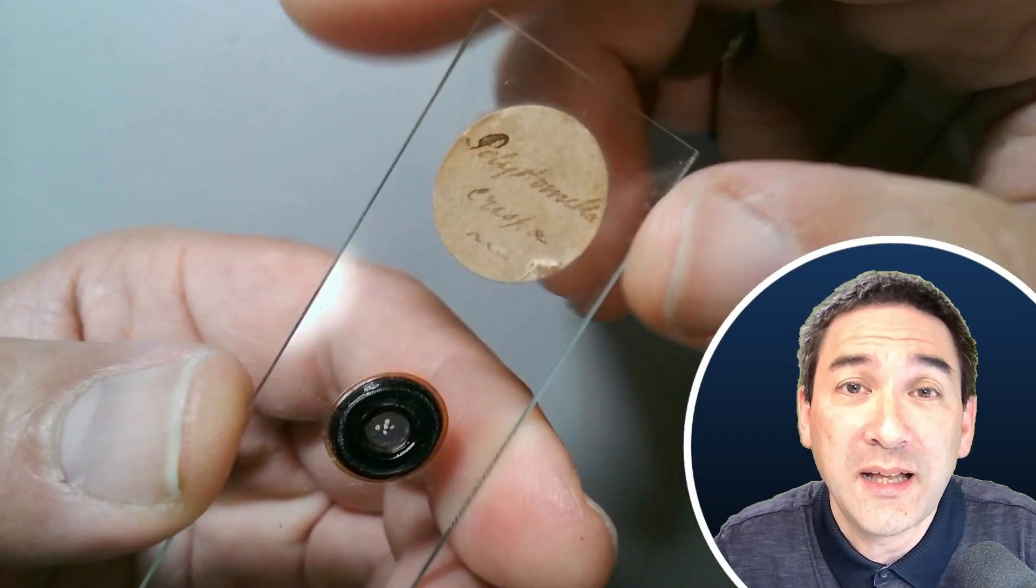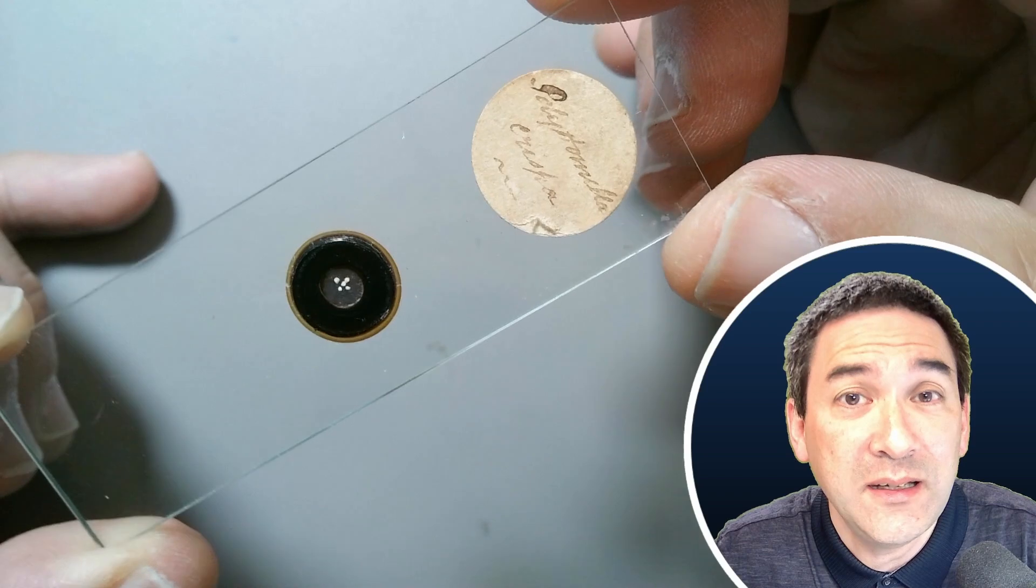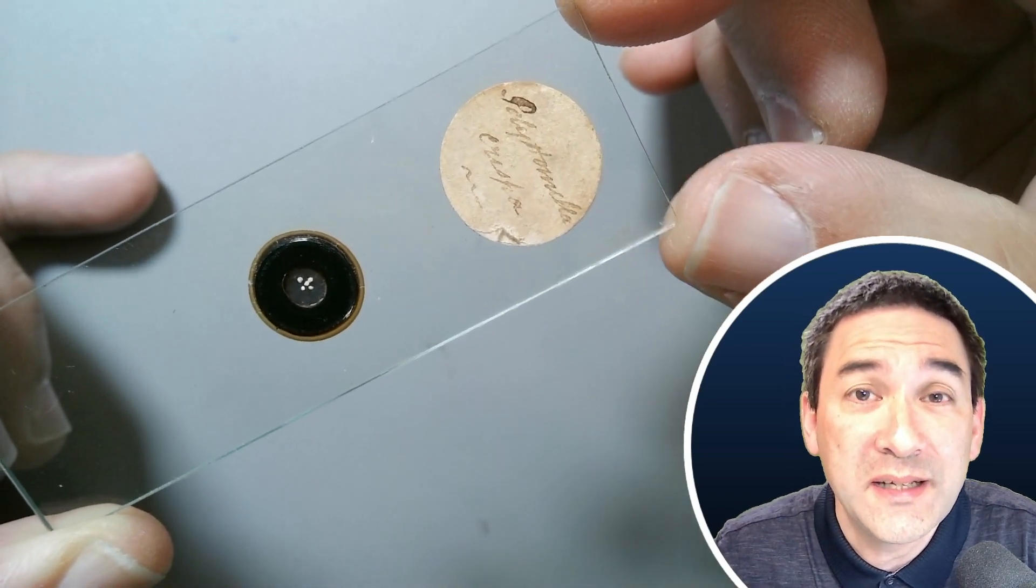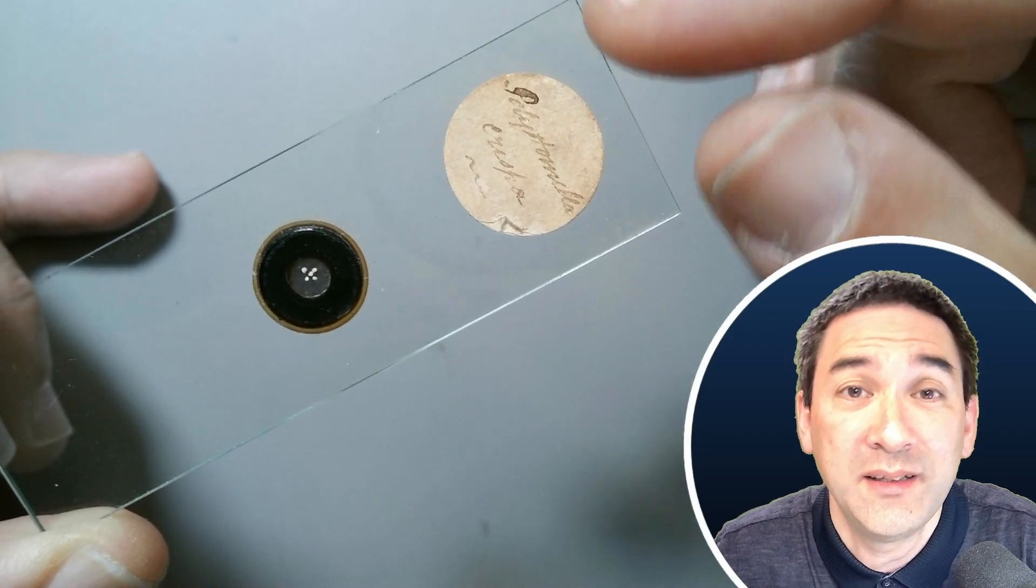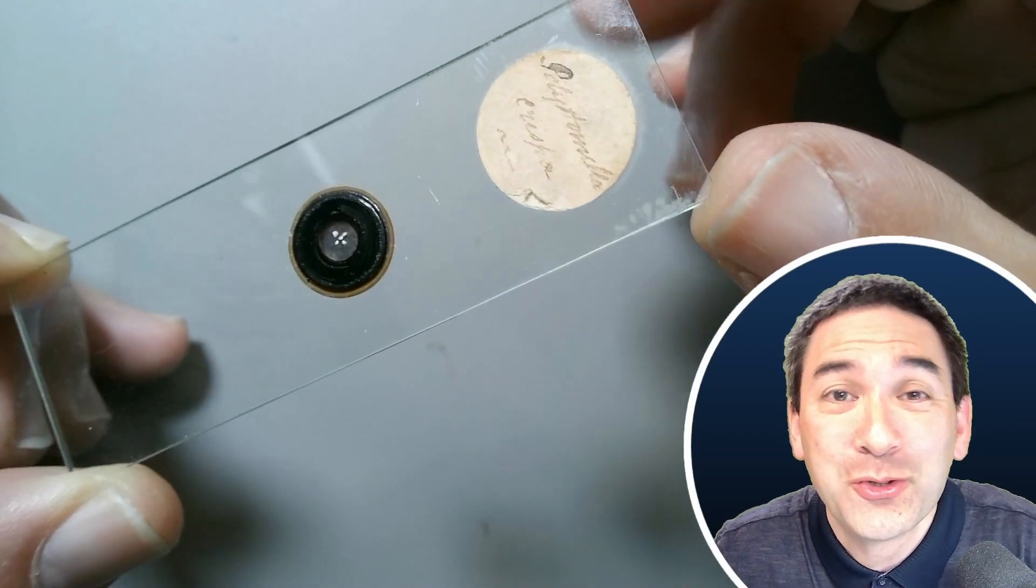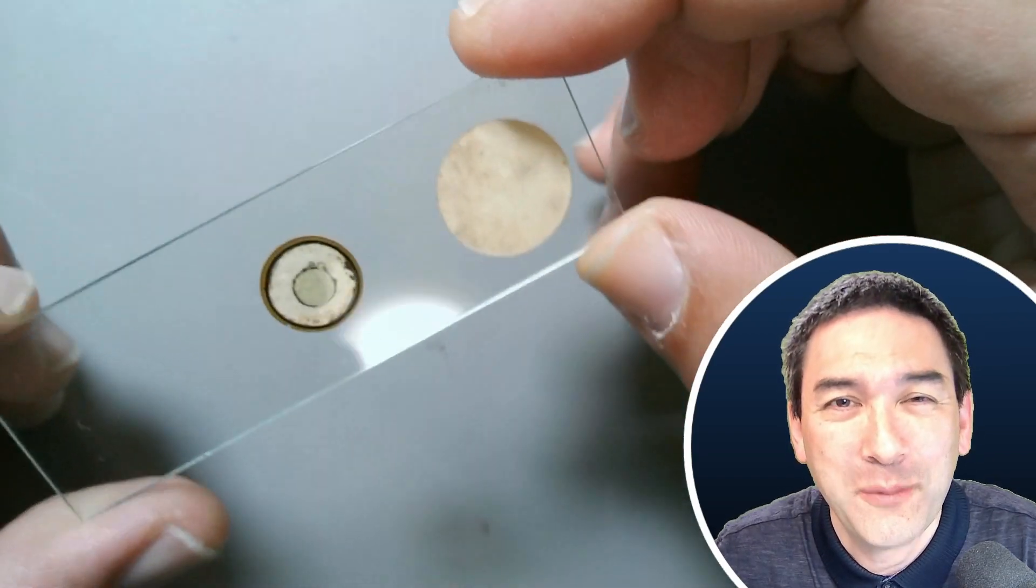So I bought this slide online. Unfortunately, I do not know exactly how old it is. I do assume it's around 100 years old, based on the way that the slide is made and also on the handwriting and the slide label. But unfortunately, there is not a lot of information on here, so my suggestion is if you make slides yourself, put more information on it.